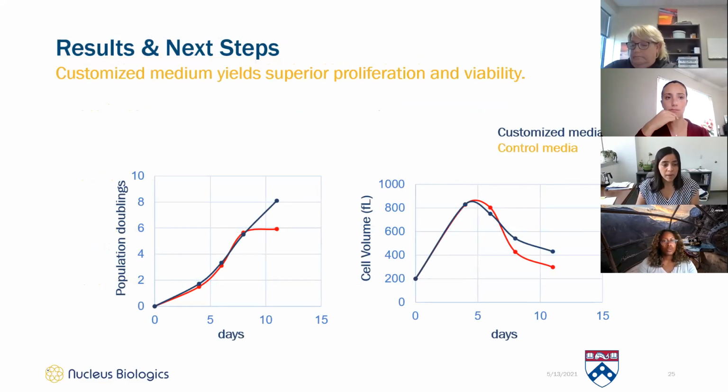One of the important determinants of the current approach that we use in the clinical sector is the proliferation of the T cells. So in a series of preclinical assays, we are always interested in looking at the proliferation of CAR T cells and their viability. We do this rigorously at regular intervals with flow cytometry. And we also monitor the cell size, which is an important determinant of the activity of the T cells.